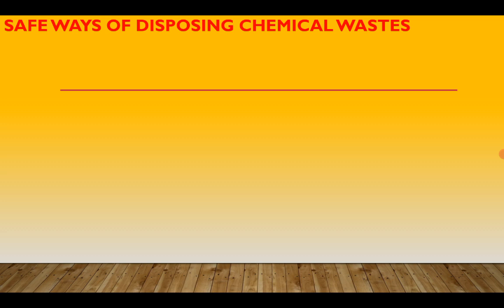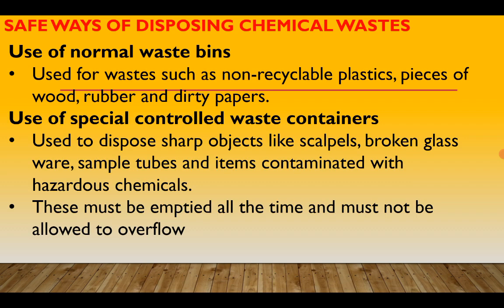Great. So how do we dispose of chemical waste in a safe way? We are looking at the safe ways of disposing chemical waste. How can we get rid of chemical waste in the lab so that the lab becomes a safe place to work in? If we don't dispose of chemical waste in the lab, it is going to be very dangerous to work in.